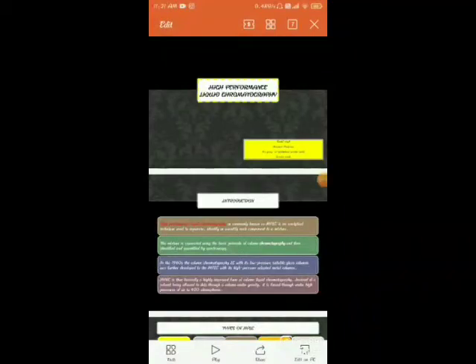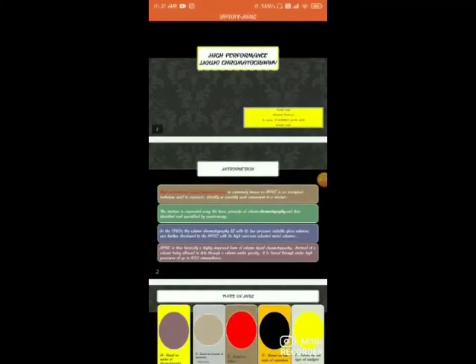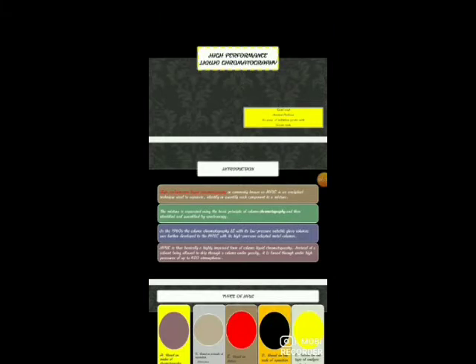The pressure we applied on this. Due to the smaller size of particle of stationary phase, the packing will be tight. Due to the tight packing, flow rate of mobile phase will be reduced. So we increase the flow rate and increase the separation of compound, and efficiency we have to apply a pressure. So this is the general things about high pressure liquid chromatography.